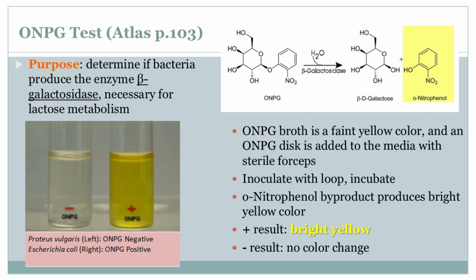And going back to our doctor with that patient who has the infection, knowing if the bacteria causing the problem can digest lactose is going to be super important for deciding on the right treatment. So it's like we're profiling the bacteria, but instead of fingerprints, we're using sugar. Exactly. But it's not just about identification.